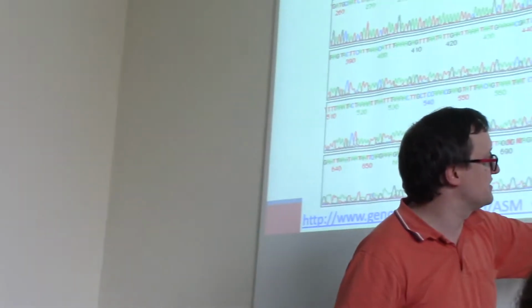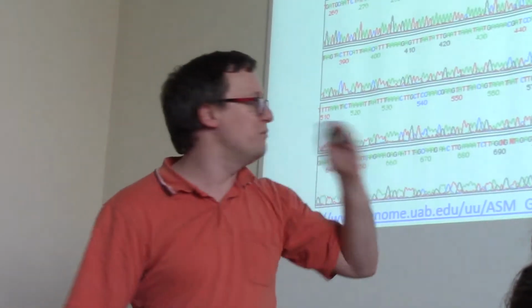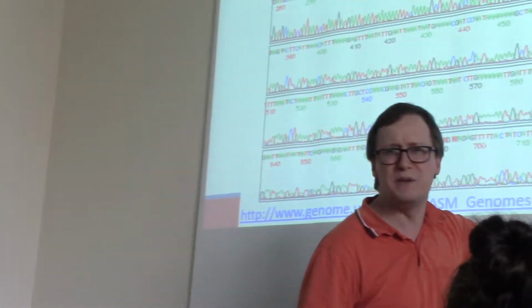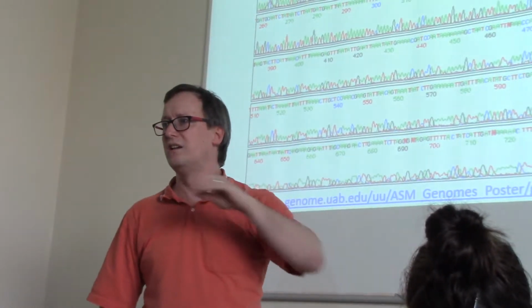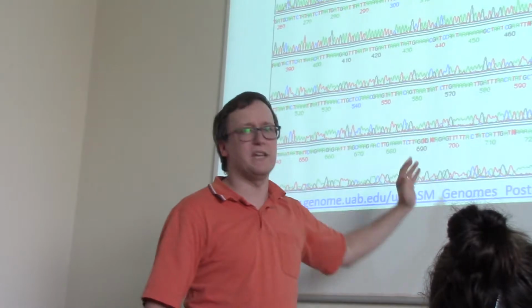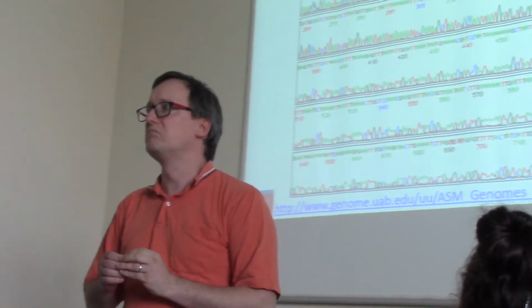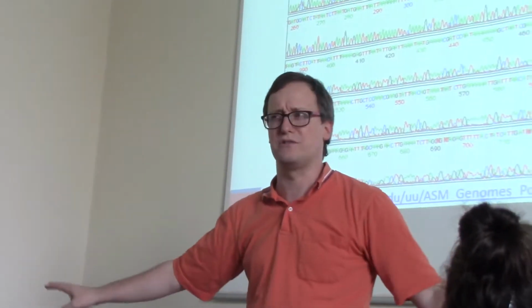So by the time you get to this smear out at, say, 736 or so, we have a whole bunch of A's, but we're not really sure how many of them there are, because there's barely even a wiggle up and down in that mound to tell us how many A's there are. If we were trying to be very simple about this, we might say there's a first nucleotide base that we feel comfortable about, and there's a last one, and anything outside that we're going to just throw out.